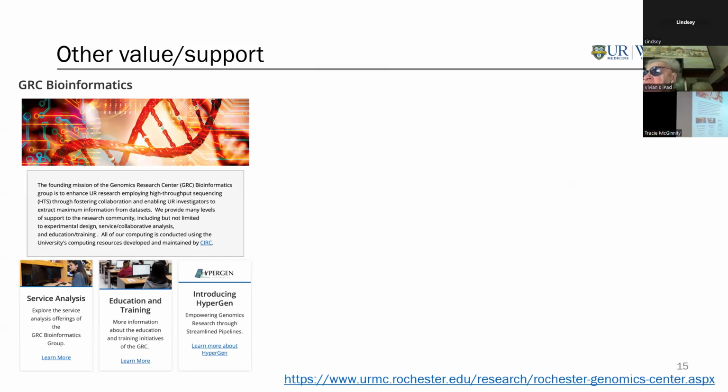It's fairly new and only has a couple of workflows, but it's meant for anybody that works with us or has some public data that they can upload to it and say, I want to run the exact same RNA-seq analysis that Genomics does. You can do that very easily, in your own time, whenever you're ready. You get the same figures, the same type of output that we would do for you if you asked one of the bioinformaticians to do that for you. The difference is you can do it whenever you want.